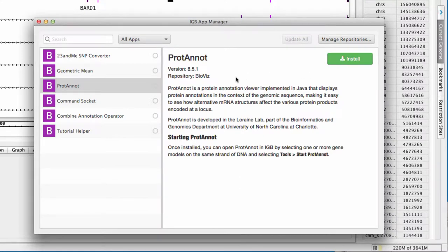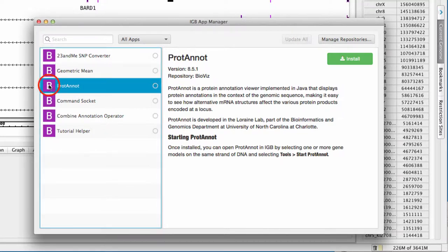By default, apps are available through the BioViz repository, maintained by the IGBY team. This is indicated by the letter B next to the app name.